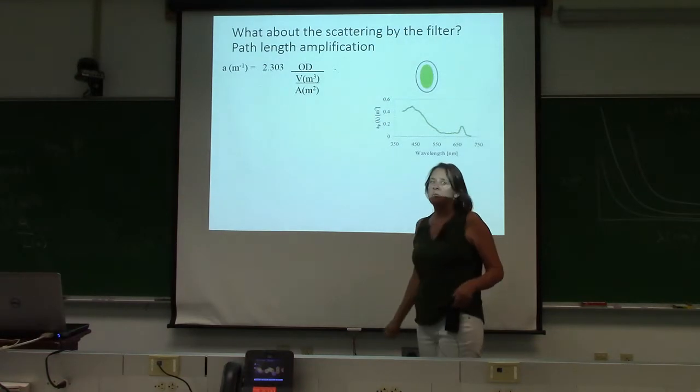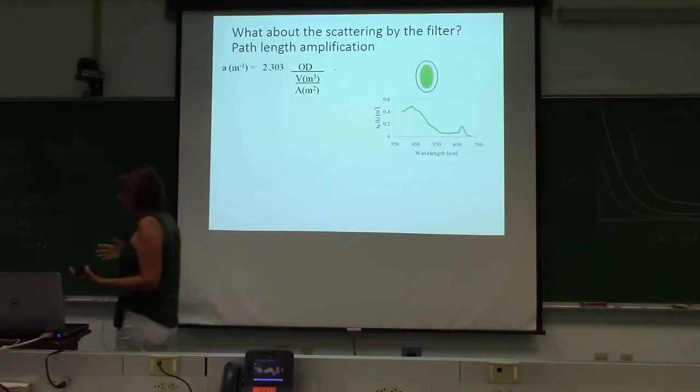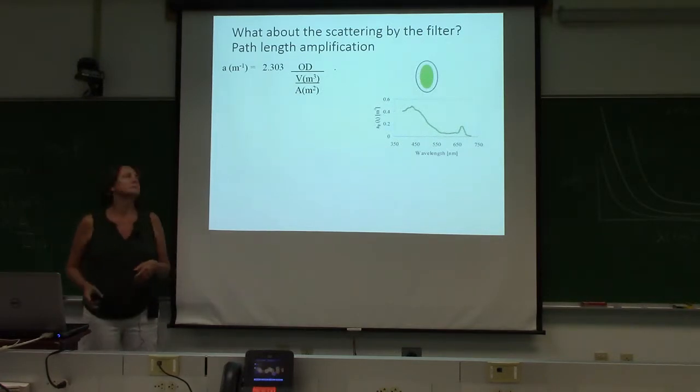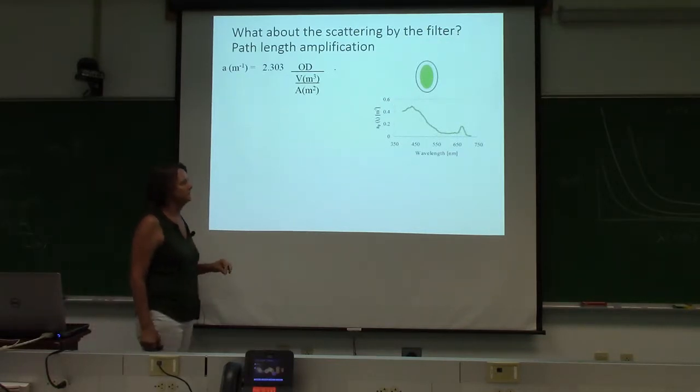So what about scattering by the filter? The filter itself scatters, and it scatters through the particles, the light, and the integrating sphere itself scatters. And so we have to account for that because it's an increased opportunity for reabsorption.